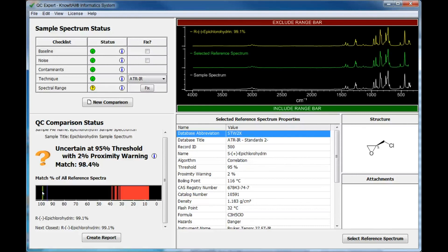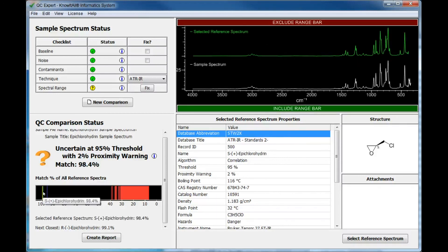In this case, the next closest match is R-epichlorohydrin, which is indistinguishable from the S-enantiomer. An uncertain warning can also occur if the match between the sample spectrum and reference spectrum is above the threshold, but the sample spectrum also matches another spectrum in the reference database that is below the threshold but within the proximity warning set by the administrator.